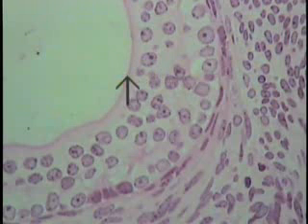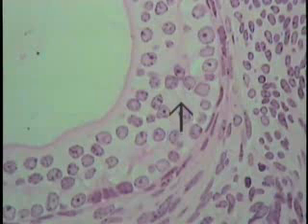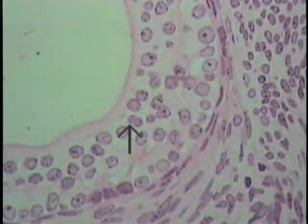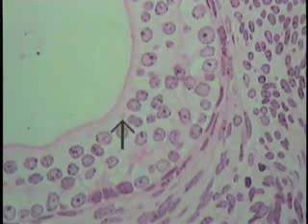Note that in some regions the cells are closely packed together and cytoplasmic boundaries cannot be discerned. When this condition is encountered, use the profile of the nucleus to give you an indication of the overall shape of the cell. So this is the individual nucleus of a cell. The cytoplasmic boundaries are very indistinct, but are approximately here.